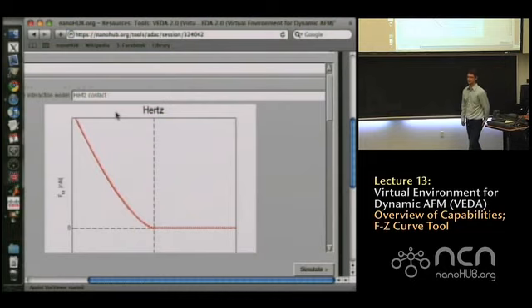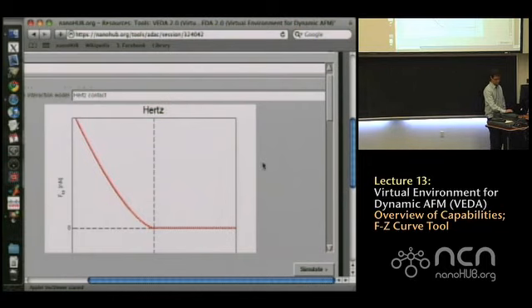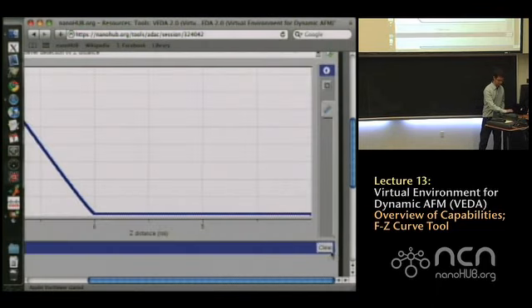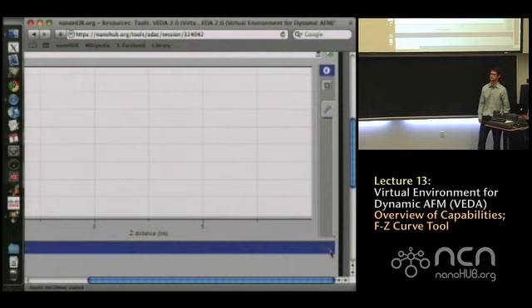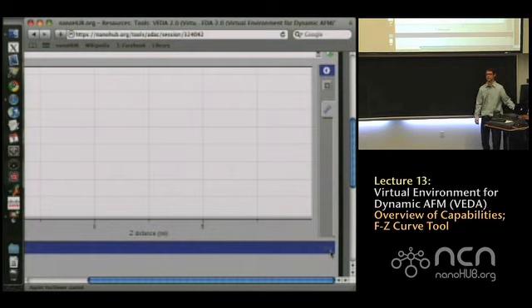Oh, and I should mention that after you run a certain number of simulations, if you're transitioning to a new simulation or a new set of simulations, you want to clear out the old ones if you haven't saved them. Down at this bottom corner on the simulations tab, there's an option to clear the data. Okay? So on the results page, it's down at the bottom corner. And occasionally you want to do that, just if you're changing too many parameters, it gets complicated in terms of the display.